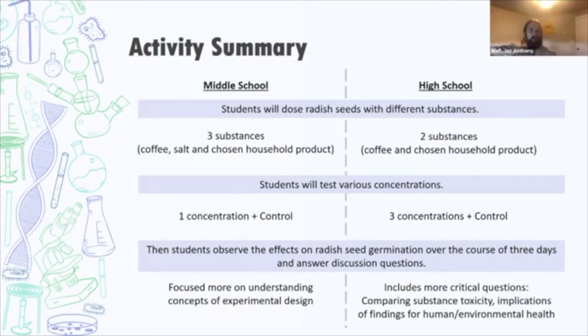I just have a quick question about the logistics of somebody setting this up. Once you get the experiment set up and going, how long does it take for the seeds to germinate, and what sort of results are we looking at? There was one question in the chat about potentially eating the radishes, and I know we're not getting to radishes, but eating the germinated product, and we definitely advise against that. You shouldn't eat experiments. But how long does this take, and what's the data that's being collected specifically?